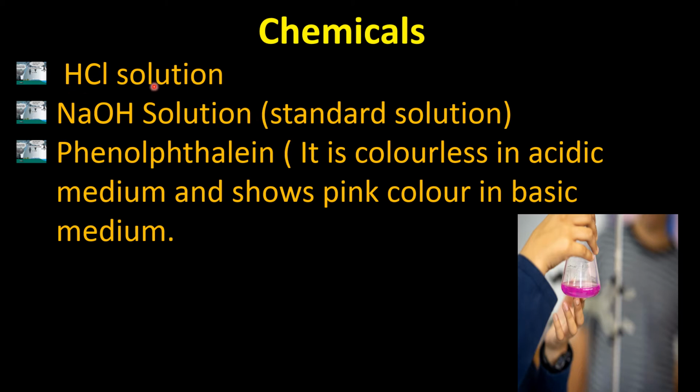Now the thing which is very important is chemicals. Please remember, students, whenever you write it in the exam sheet, you have to give each and every heading carefully. Write the apparatus, then the material required, and then after that the chemicals.